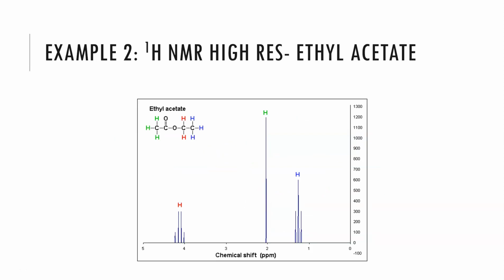Looking at esters are great for chemical shift and for splitting in helping us figure out what's going on within the ester. We've used color here, so these hydrogens correlate to this peak here. They are isolated from all the others, so N plus 1 is going to be 0 plus 1, so we see a singlet for these 3 hydrogens here. The CH2, however, is next to the CH3, so N plus 1, it will form a quartet, and this is the quartet that we see here. And then our CH3s, which will have the lowest chemical shift down here, the blue group here is going to be our CH3 next to our CH2. And we can see that by the triplet splitting here of N plus 1 is going to be 3.